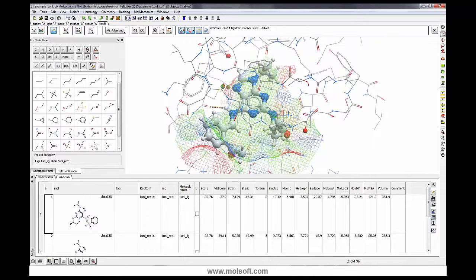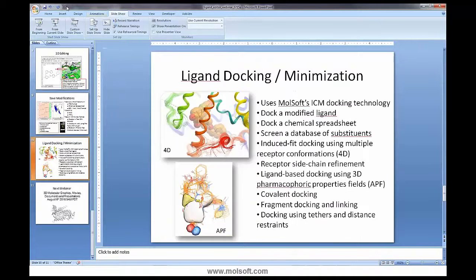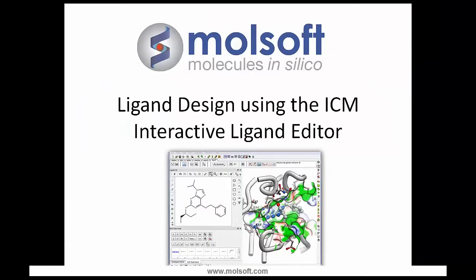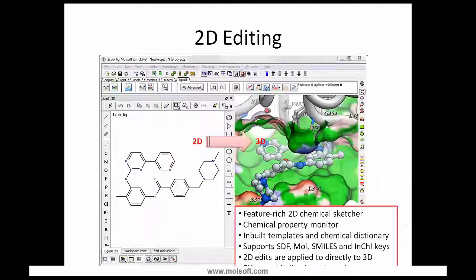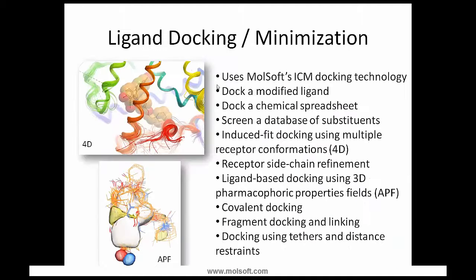So let's have a quick slide on docking in ICM from the beginning. The docking uses MolSoft's ICM docking technology. The original method was developed by Ruben Abagyan and Max Totrov back in '94, so it's been very well validated. It performs very well compared to other commercial programs.